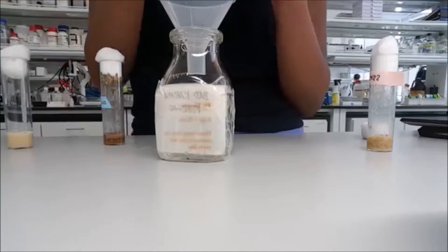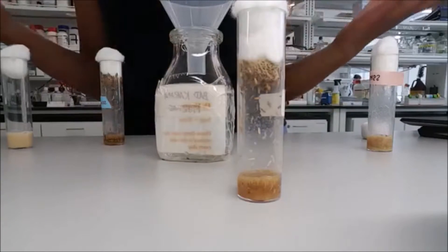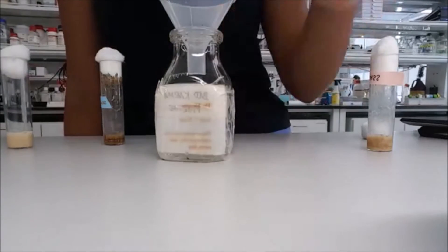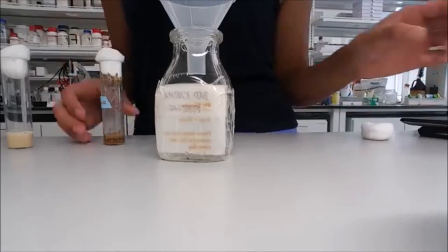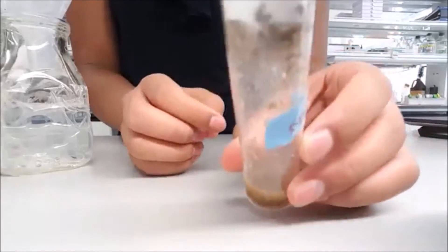This vial has larvae and pupae and there are no adult flies, so we're going to leave this one to develop, just like we did with the first vial.